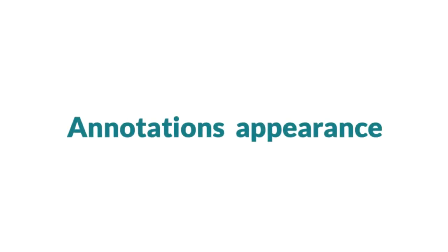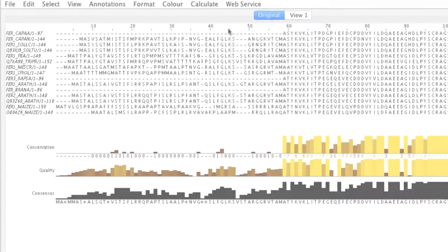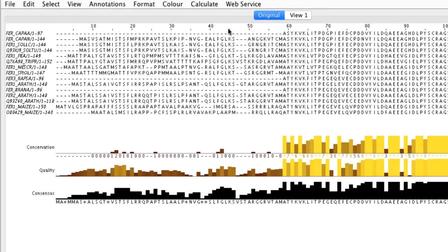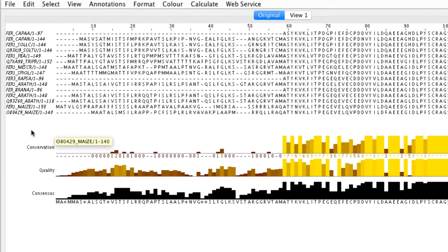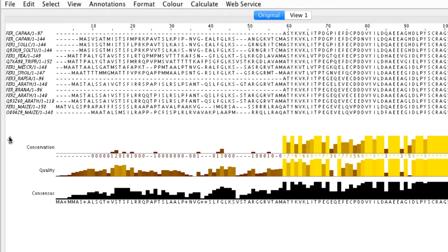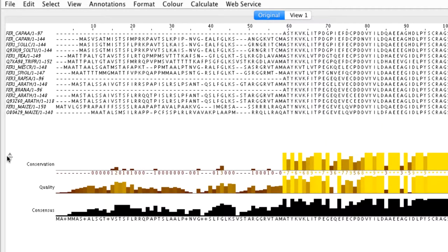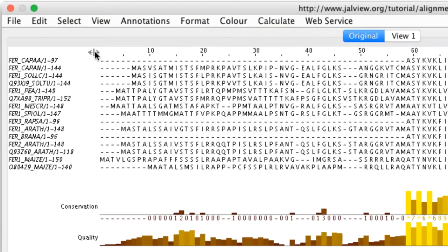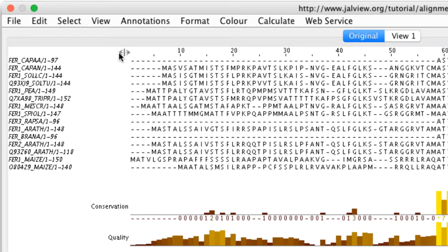The appearance of annotations can also be customized. For example, the overall position of the annotation rows can be changed. By moving the cursor to reveal the reposition icon, then clicking the icon and dragging it, you can move the alignment up or down or left or right.